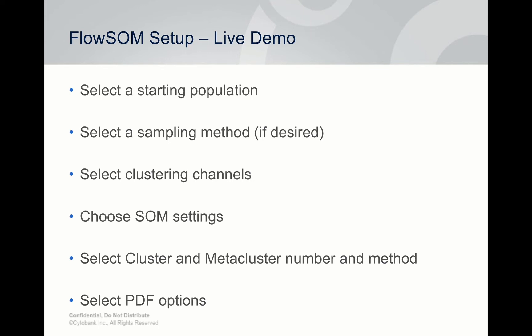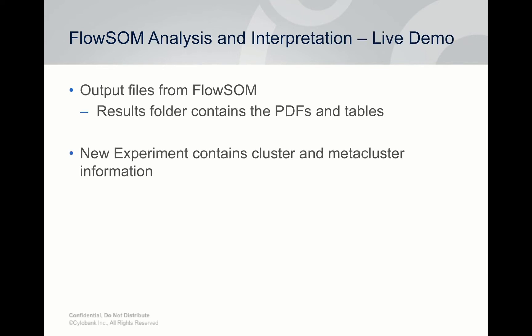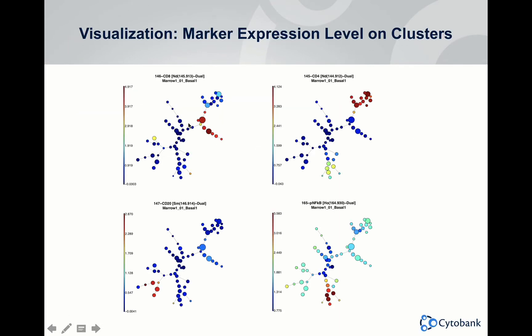The output files are similar to a SPADE tree — each channel you selected colors the nodes by the expression level in that channel. Here you can see what CD8, CD4, CD20, or NF-κB expression looks like across all your different populations.